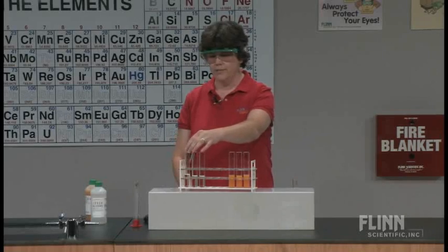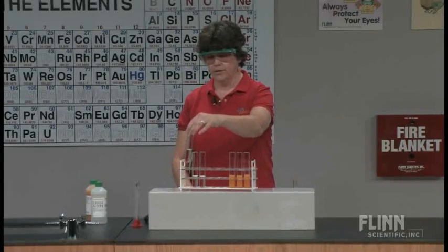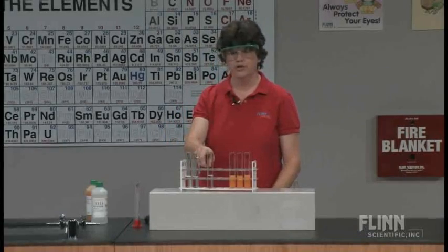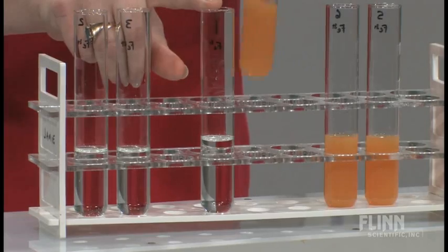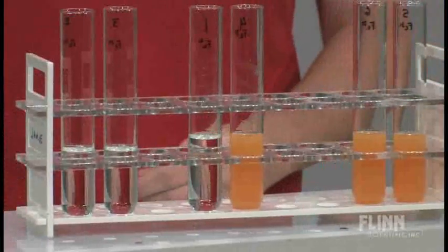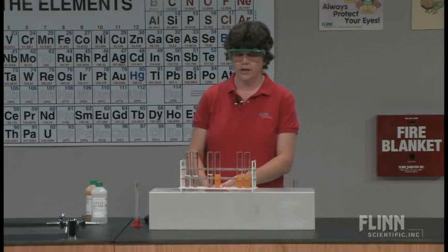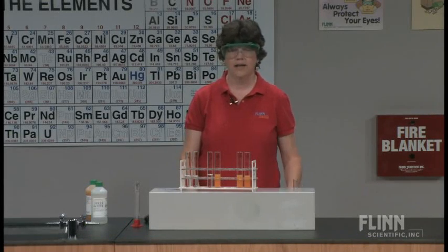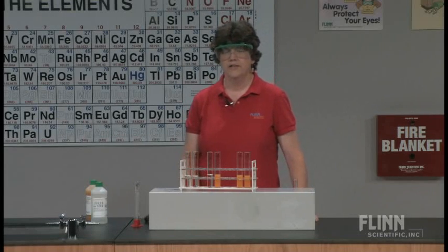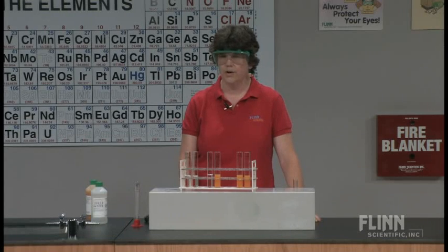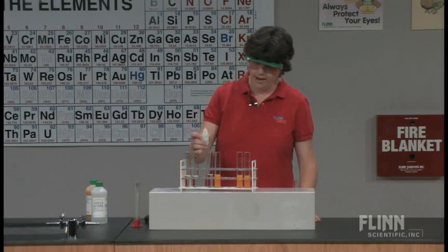So in test tube number one, which I'm going to move to the middle here so we can have some comparison, I have already my iron two sulfate and I have my iron three sulfate in test tube number four, so we're looking at the two in the middle here. And to those I'm going to add some potassium ferrocyanide. Now ferrocyanide says that there are two plus ions, two plus iron ions attached to a cyanide in a complex ion formation. So if I add five drops.